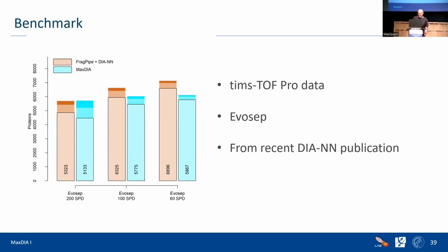Okay. And last question. According to my experience, when I'm doing DIA with experimental libraries, using Spectronaut, you get better results than in a discovery mode. So I feel that you would recommend a discovery library with DIA Max. Why is that? Yeah, very good question. First of all, that's how they did the benchmark, and we didn't want to regenerate their data with other settings or something. So that's the easy answer.